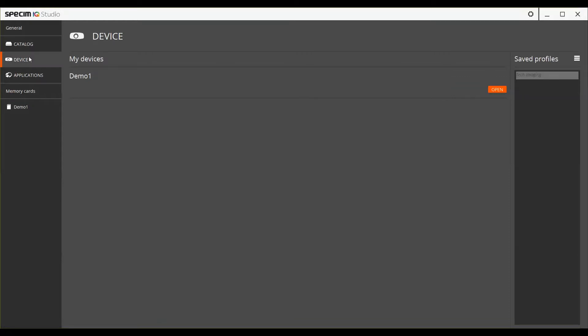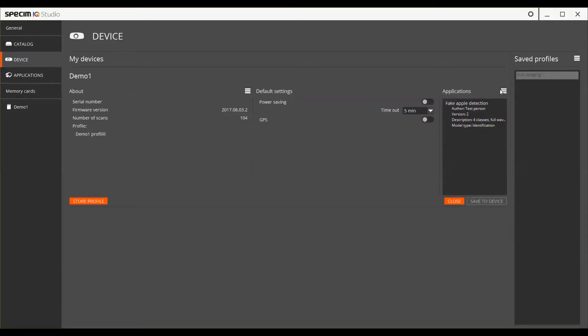In the device view you can manage your Specim iQ device. After you connect the device to your computer using a USB cable, you can change the device settings and install and uninstall applications.